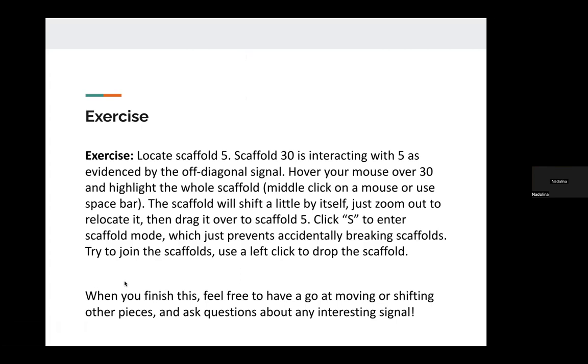Unfortunately, it's not quite like assembly where you can leave it to run. So we'll just sit here, and if you have questions, we're here to answer them. Madalena, can you show how you identify sex chromosomes on your? Yeah, we could do that. Let's do that. Can we try this exercise first and then go back to sex chromosomes?